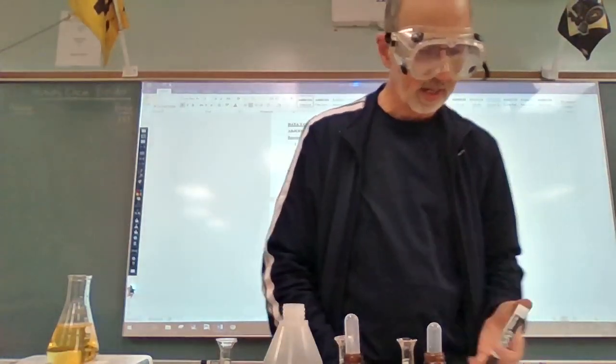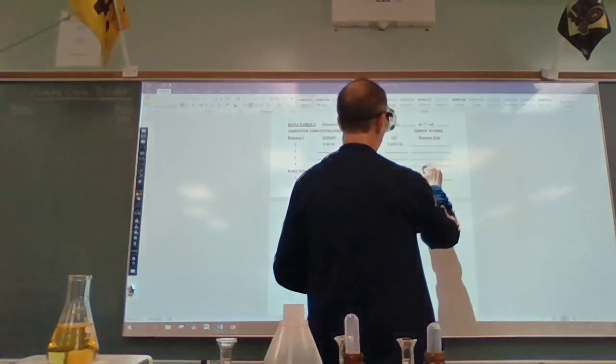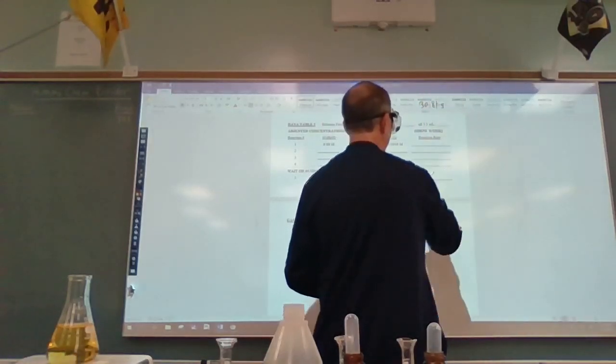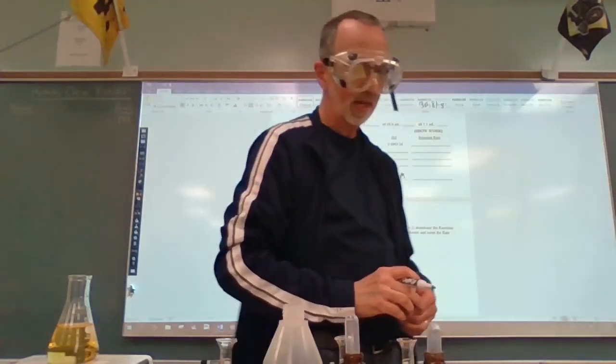32.22 seconds. Our class average, though, was 30.81 seconds, up there for our average time in reaction 5.